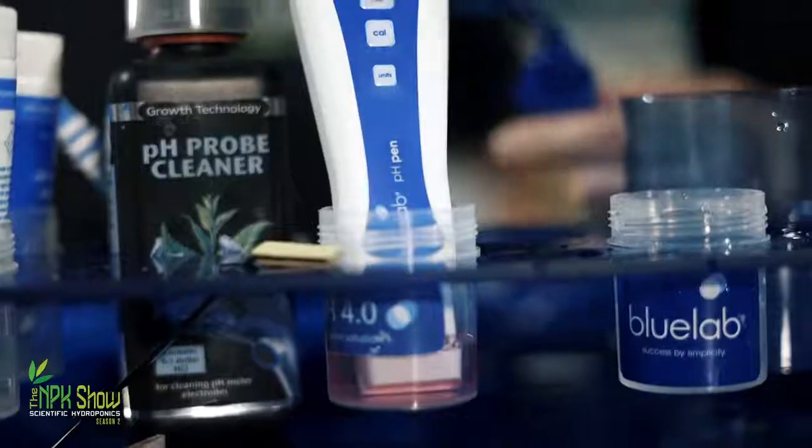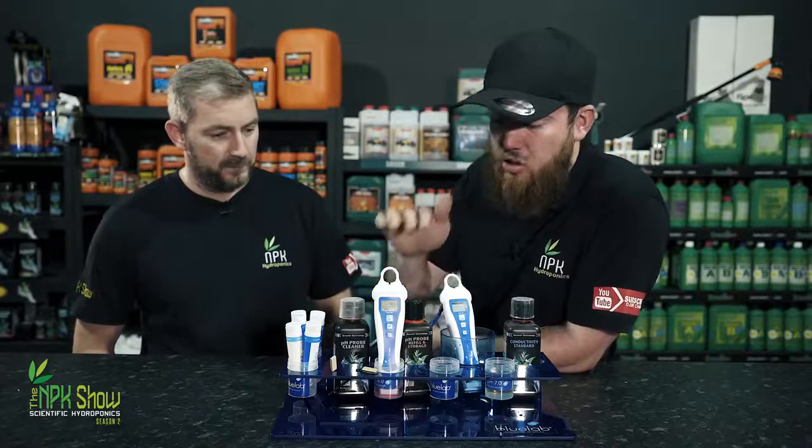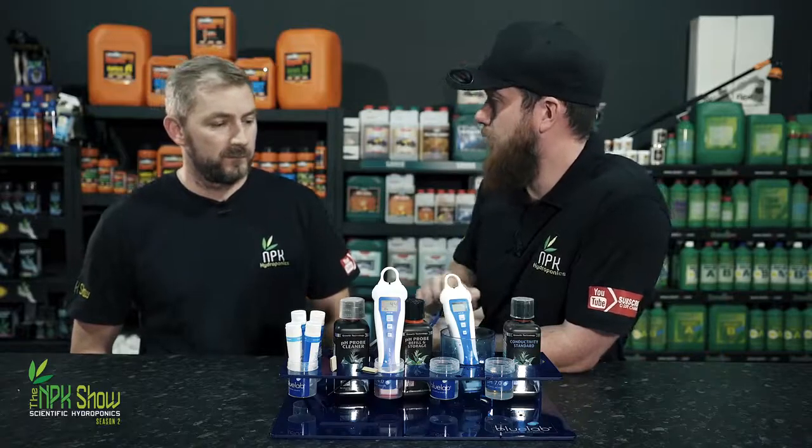And then put it into your pH buffer 4 solution. And again, you're going to leave that there for about 4 or 5 minutes. Make sure it hits as close to 4 as it's going to get. And then you do the same. Press the calibrate button and that's done.